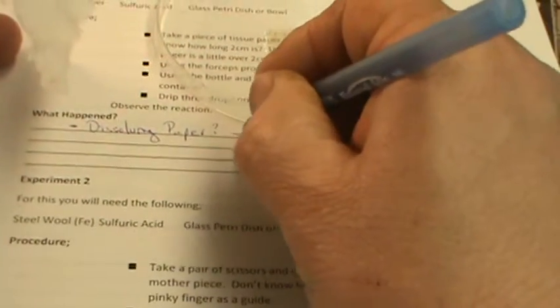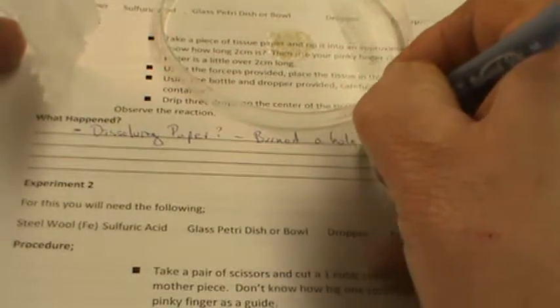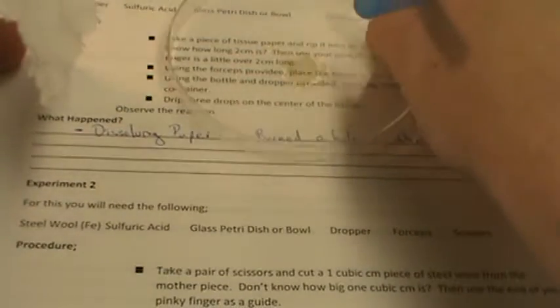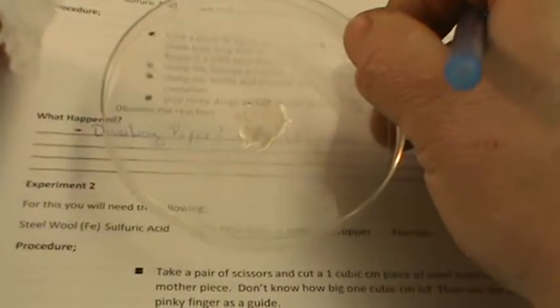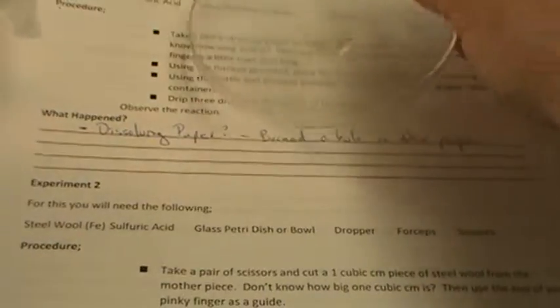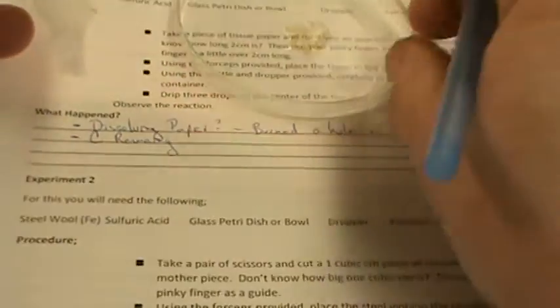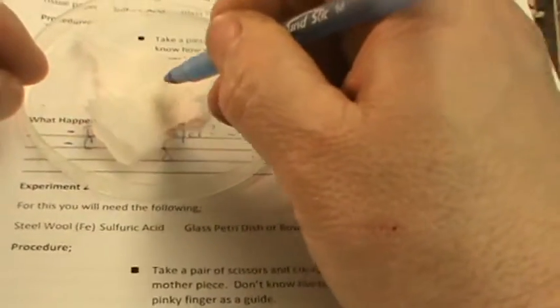So we burned a hole in the paper. And here in the middle, we have some little black specks and brown specks. Let me put that underneath so hopefully you can see some of it a little better. Those black and brown specks are carbon remaining in the acid, the carbon that was left behind. I'm going to put that back in and we'll let it dissolve some more.